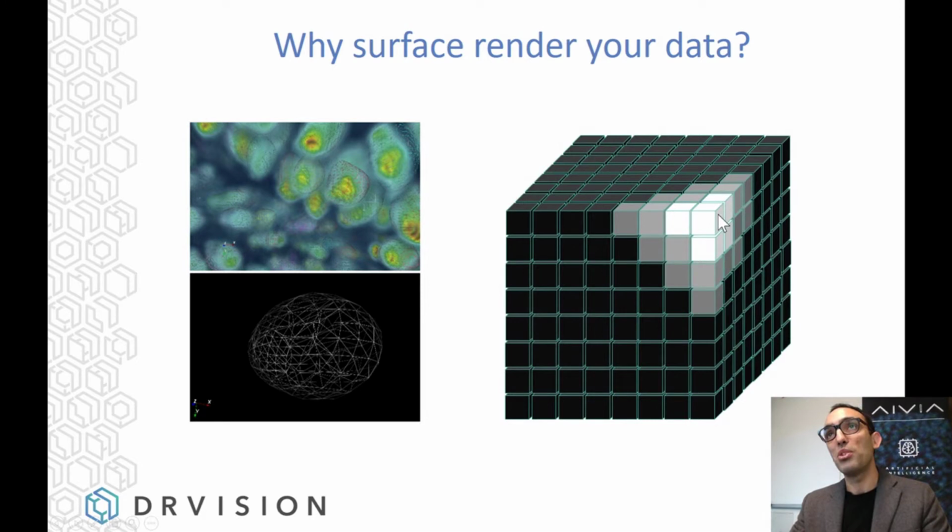That little corner that we saw in the previous picture actually looks a little bit like that. If you can imagine the other 7 cubes, this is one of the cubes. If you imagine the other 7 cubes, it will actually make a 3D shape that looks a little bit like that if you threshold it around these light or dark gray voxels.